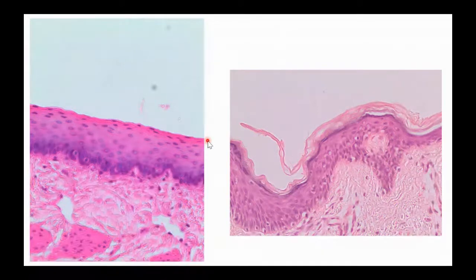Yeah, exactly. Squamous was my word that meant we were squashed or squished. I have more than one layer of cells. They are squished cells. These are what we call stratified squamous epithelium. Stratified squamous epithelium comes in two types, and it is important that we're able to identify the difference between the appearance of these two types.